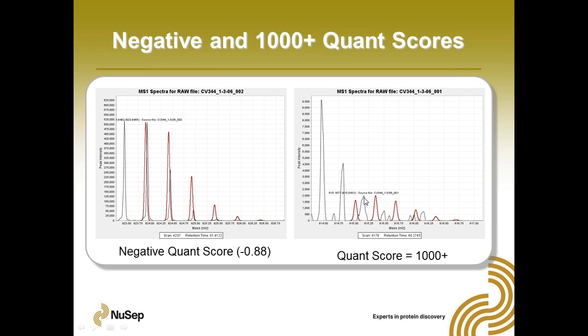So in this example, we could treat these 3 peaks as just a stick, as a centroid mass, and we're able to correlate these 3 centroid masses to each other. So the centroid masses overlap. There's no theoretical isotopic distribution, but it's just a simple closest mass match between your isotopes. All right, that's a fallback for your centroid analysis, or no fitting at that point. But anytime you're using an LTQ, that is what you'll see.